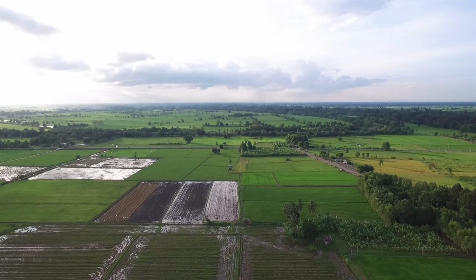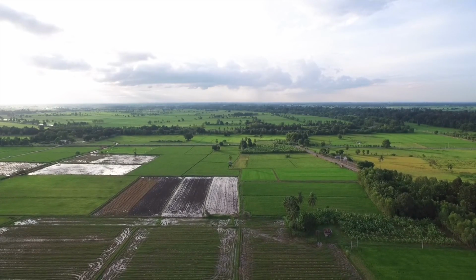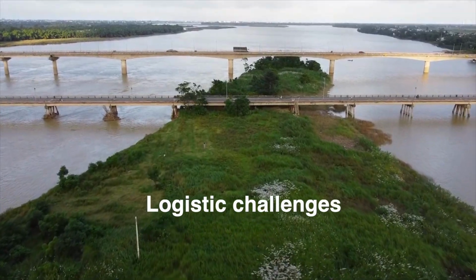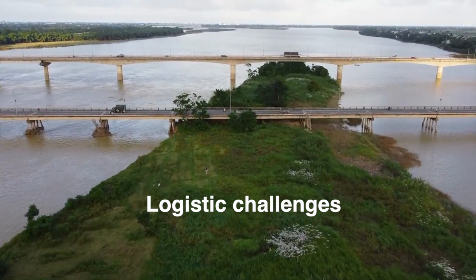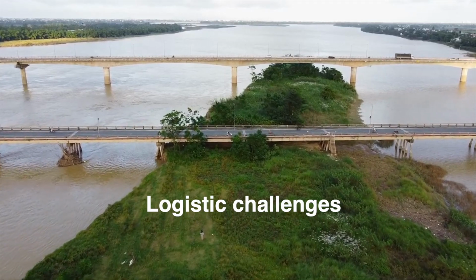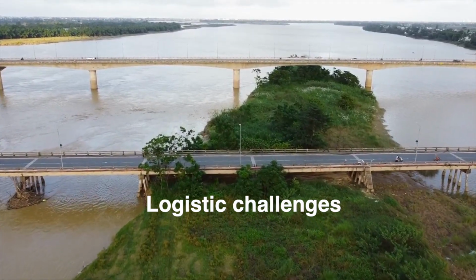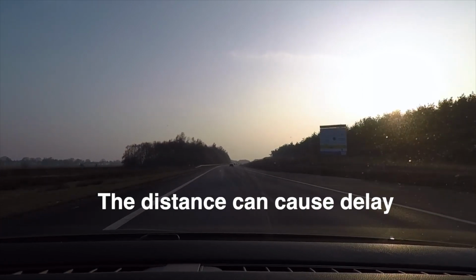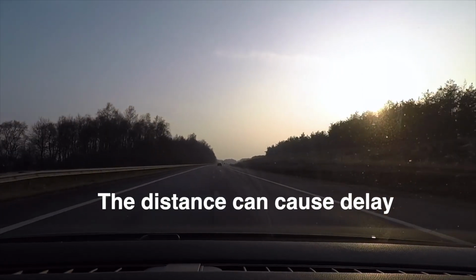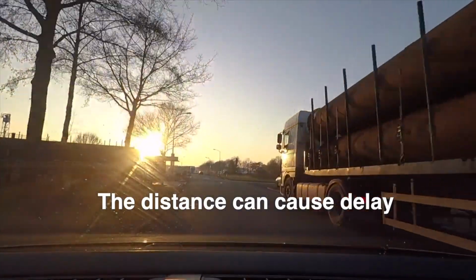This situation presents a few problems. Two of the major problems are, firstly, logistic challenges: bringing the samples from the fields to the lab facilities without compromising on the sample condition, because degradation can occur over a period of time. Secondly, the distance can cause delay in communicating the results, and that may lead to improper or no control measures.